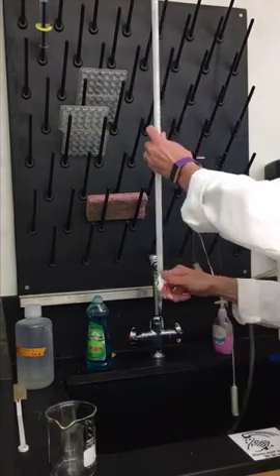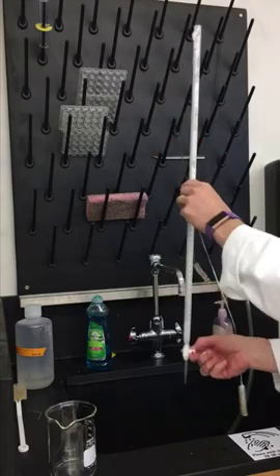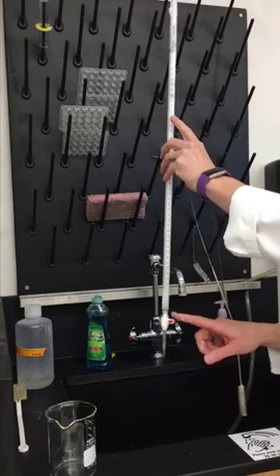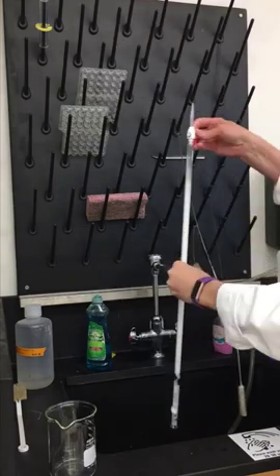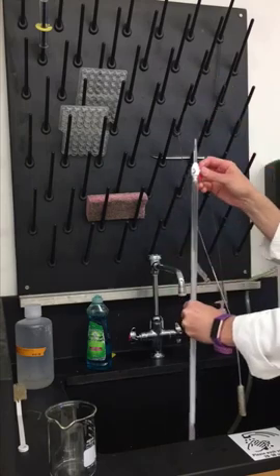I'm going to make sure some of the soap gets through the tip. Then an easy way to clean this out is to turn the burette upside down and open up the stopcock so that I don't form a vacuum and all the liquid comes out. So I turn it and open up the stopcock.